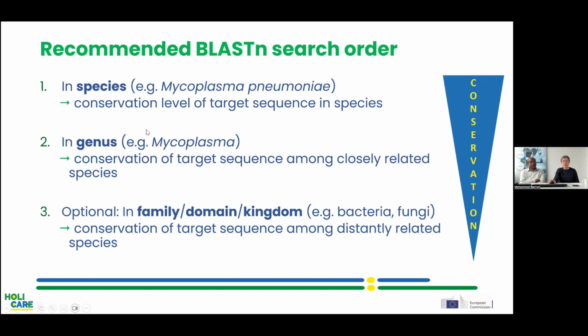And now we have tested or found out that the 16S is conserved in the Mycoplasma pneumoniae species. This is the first step. But then you also want to know if there are significant differences in the sequence in other species that are closely and further related to your species of interest.